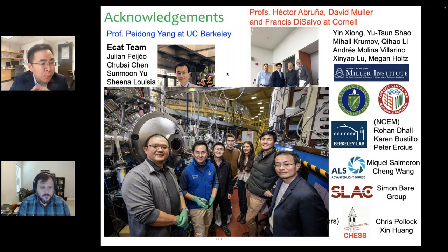After we exhaust the options we have for the soft X-ray beam, if you are a chemist or material scientist, you can always design more beam-stable samples. That's the trick we played going to larger particles. When particles are above 20 nanometers, they are reasonably stable in the soft X-ray beam.